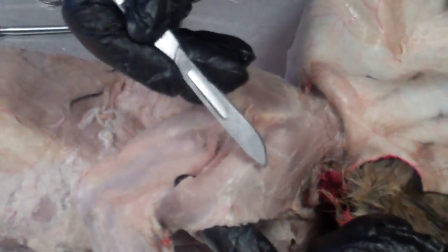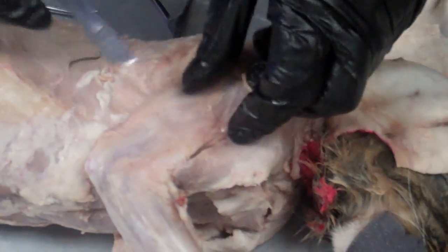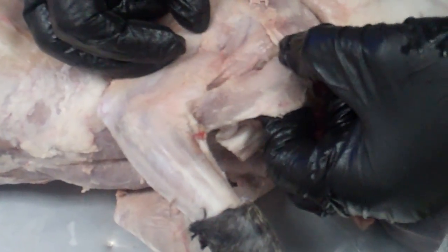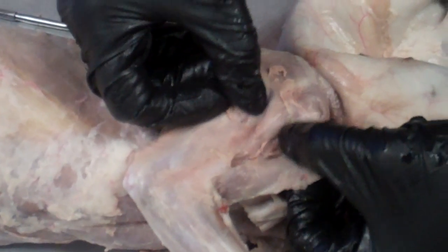Now I'm at the white line — this is the clavodeltoid. Now I'm going to look for the other deltoid muscles. It really helps to remove all of the fascia material so that you can see the lines of the muscles. Right underneath the clavodeltoid, I'm looking for the acromiodeltoid, which is right here, and I'm going to want to free that acromiodeltoid up.